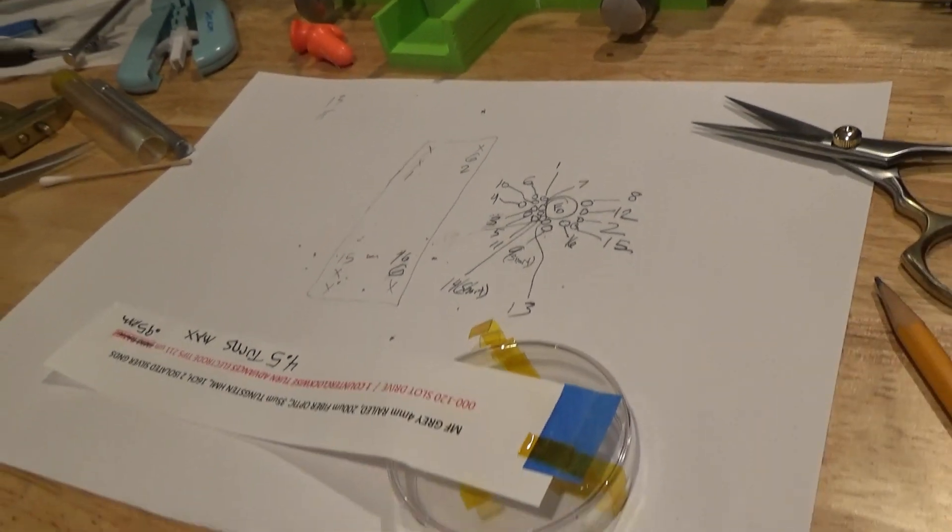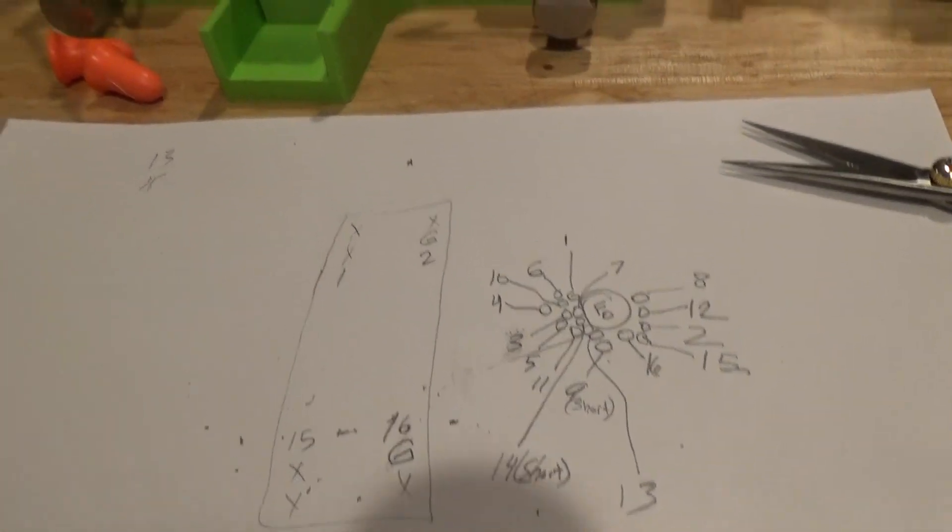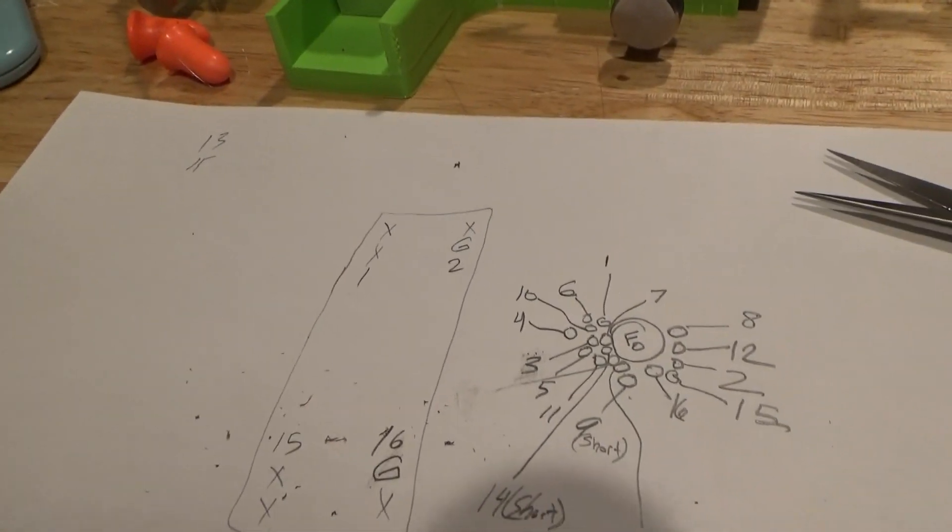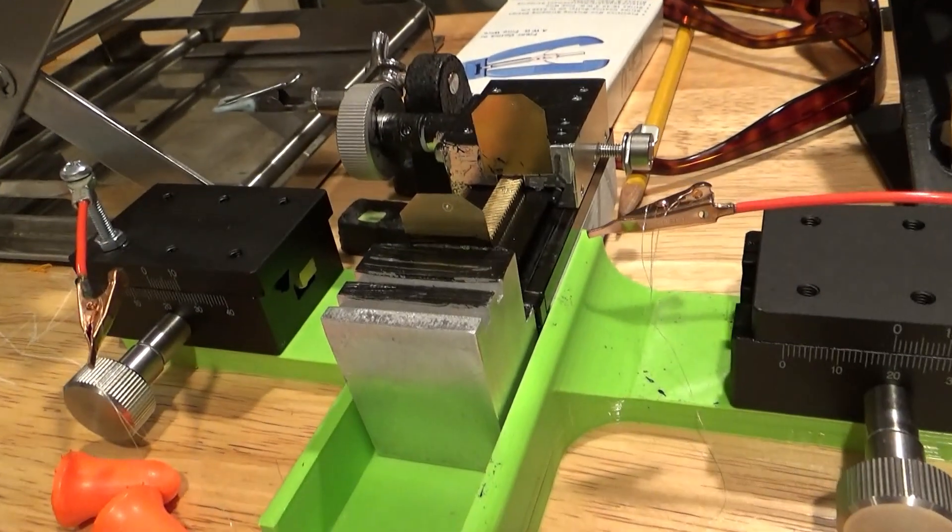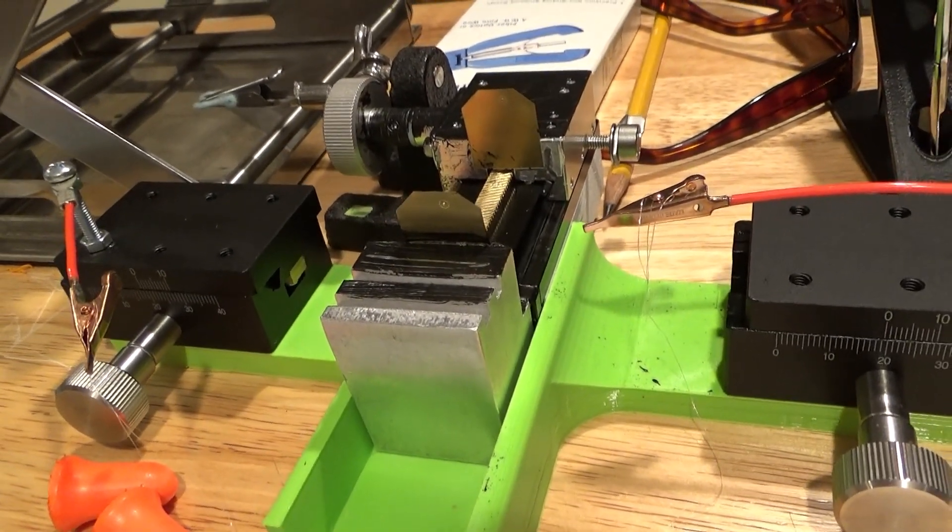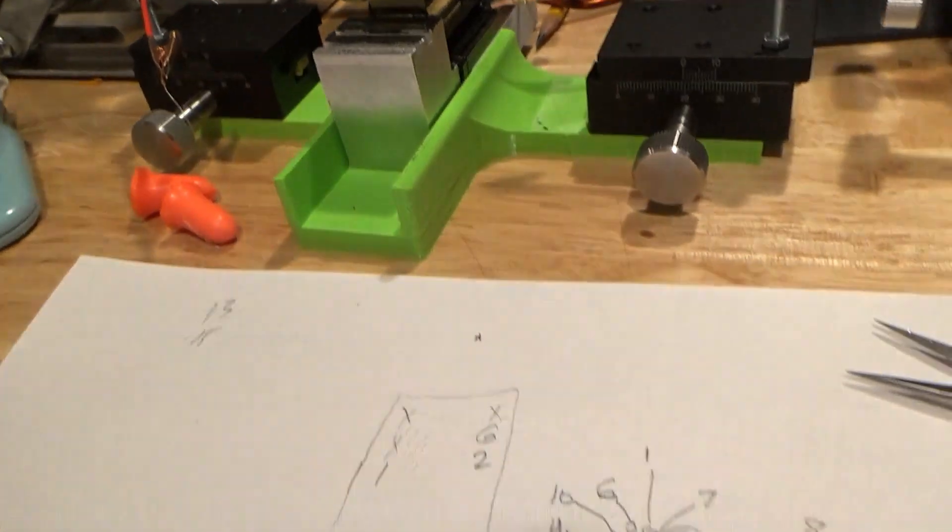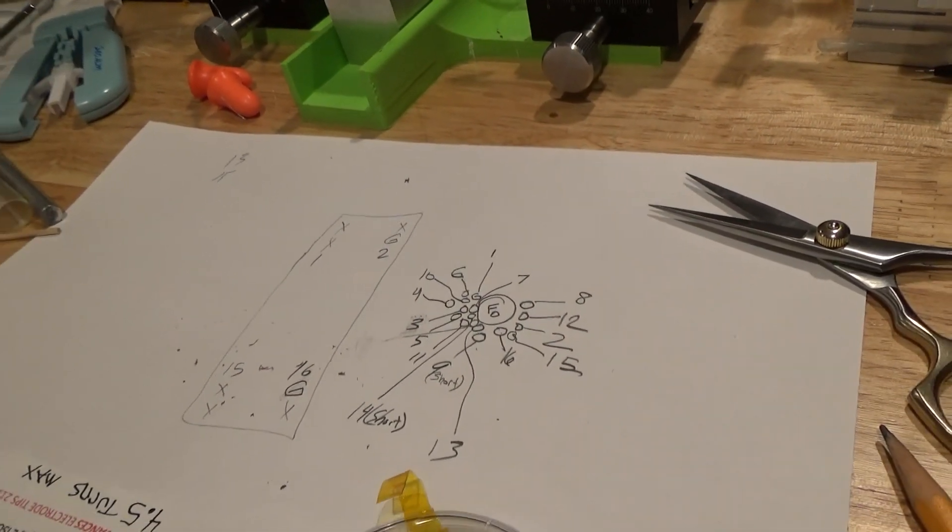In the future, we'll probably make these electrodes using an array method instead of a bundle. I'll be using a machine like this to properly form arrays, and we'll be able to track the channels in an easier fashion.